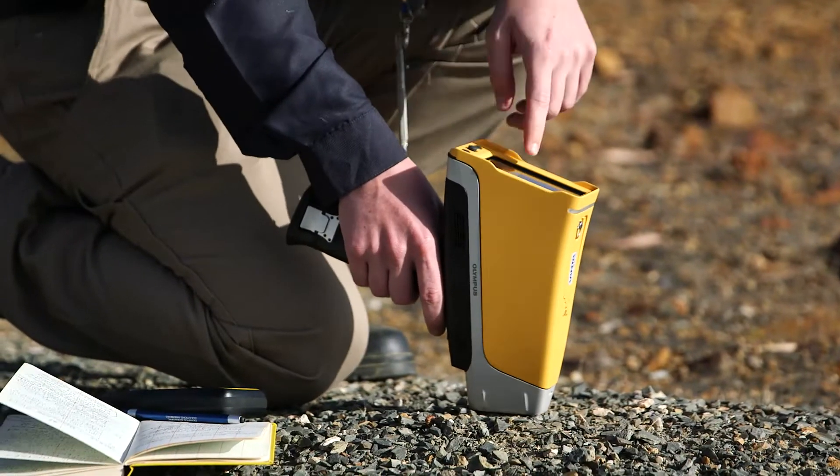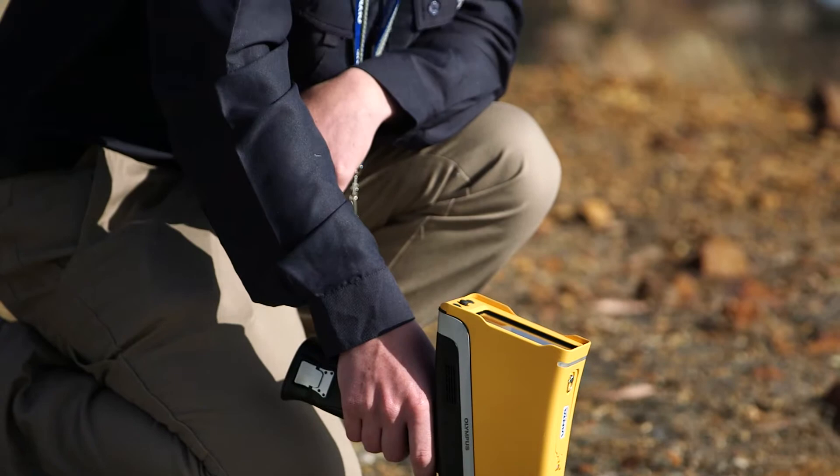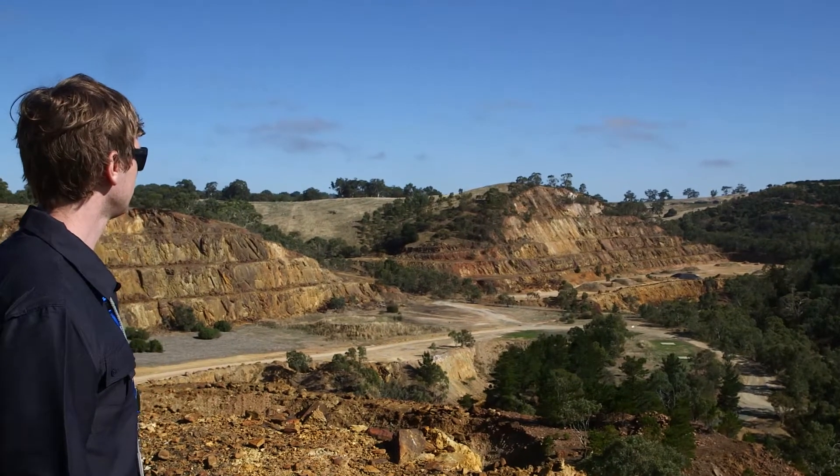Many of our customers are using third-party software such as ArcPad or Discover Mobile, because our analyzer now has an inbuilt GPS. Customers can better match their data sets and do real-time field mapping. Soil sampling is generally the first stage of any exploration project, and portable XRF is the ideal tool.